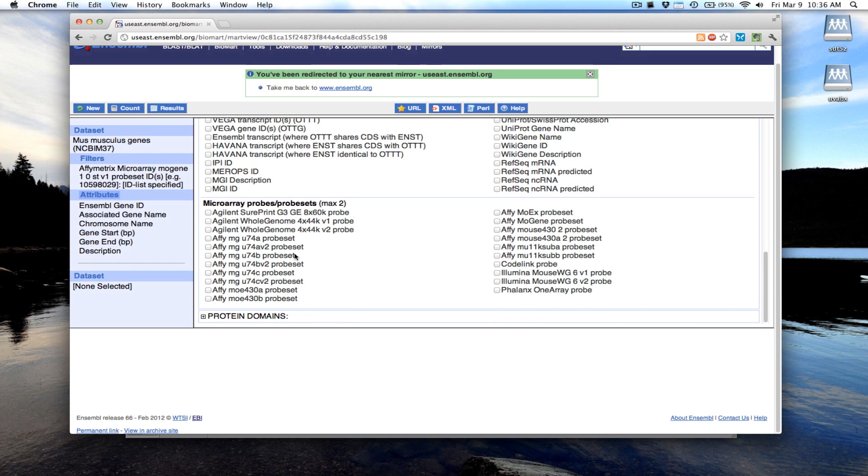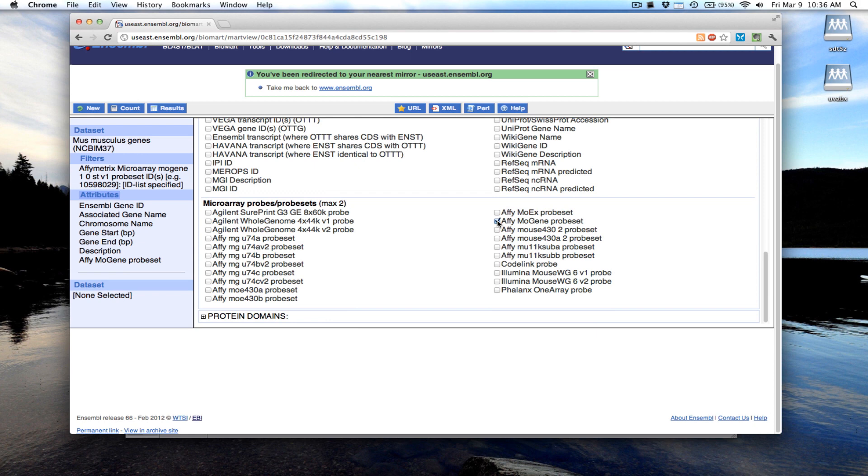Down here you can actually see which probe set IDs from other platforms map to this same gene in case you had data from multiple experiments using different microarray probes. In this case I'm going to select the Affymetrix mouse gene probe set just so we can see exactly which probe set ID maps to which gene.